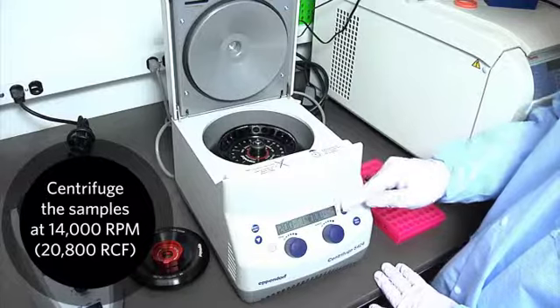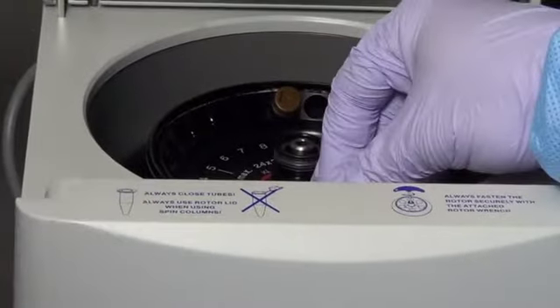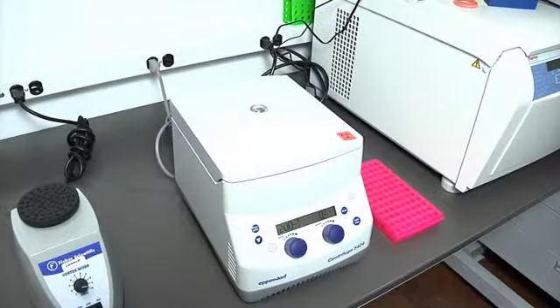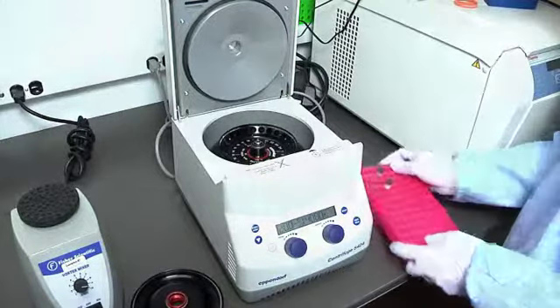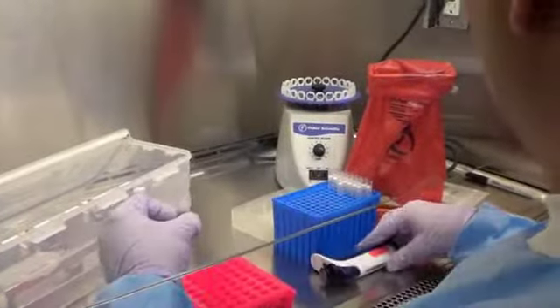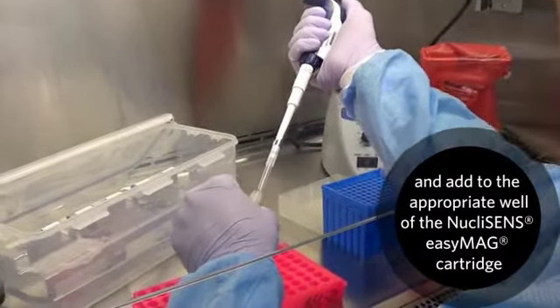Centrifuge the sample at 14,000 RPM or 20,800 RCF for 2 minutes to pellet insoluble material. Remove 200 microliters of pretreatment supernatant and add to the appropriate well of the NucliSENS easyMAG cartridge.